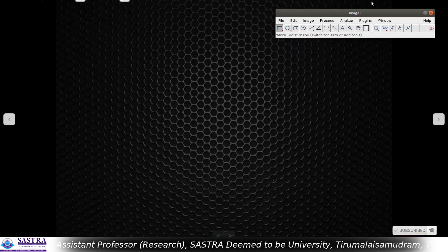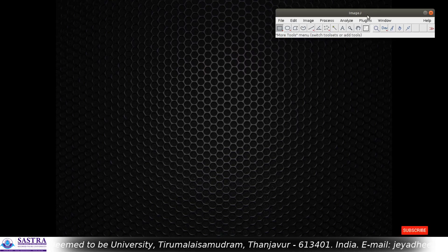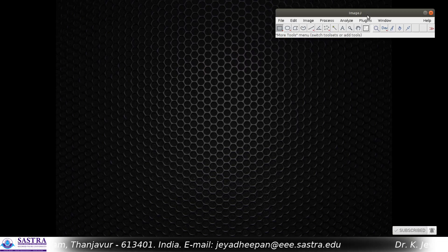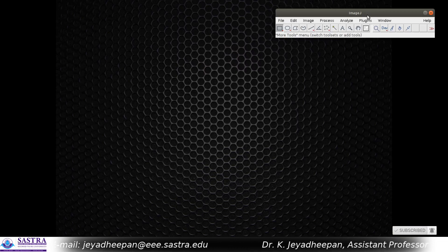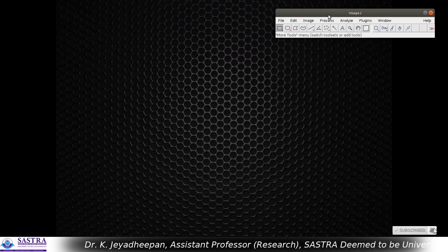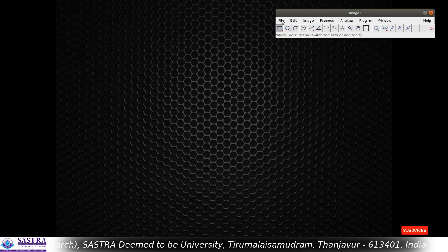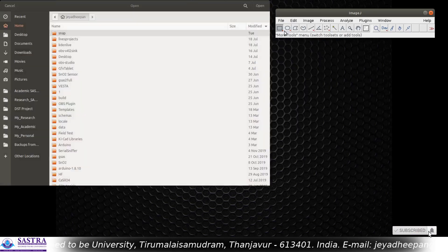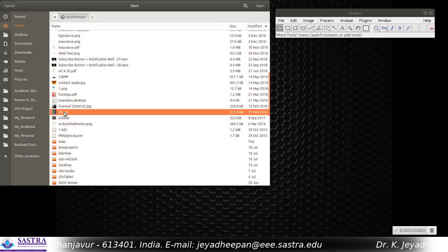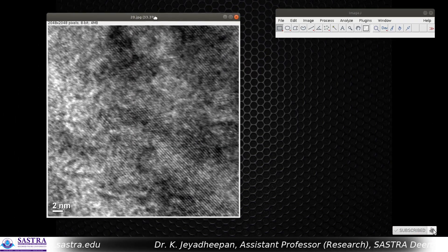Hello students and friends. In this video we are going to do a short demo on the determination of lattice fringe width or the D-spacing out of your HRTEM images. For that we are going to use the ImageJ tool. The first thing I need to do is open the file — I have the file as 20.jpg, and this is what I am going to use for the analysis.